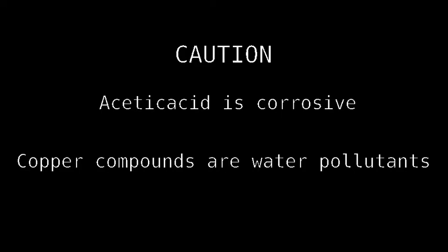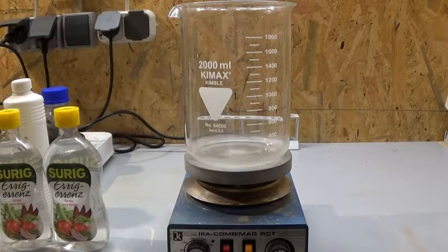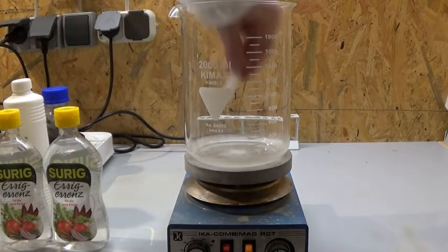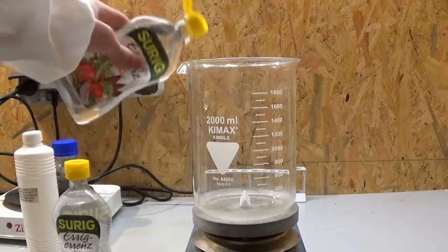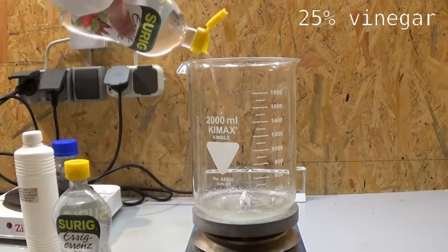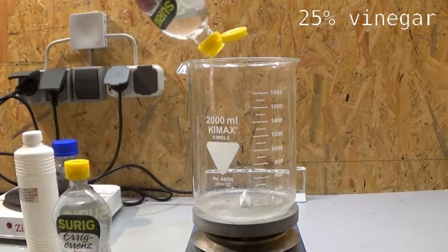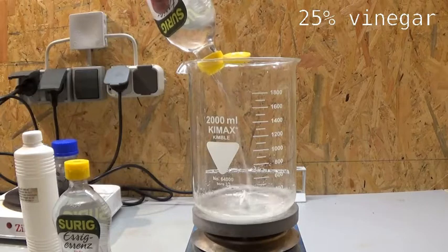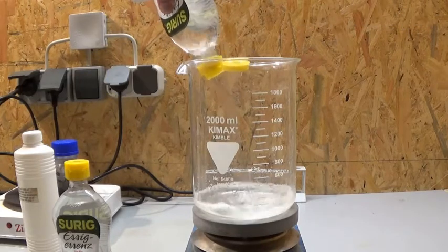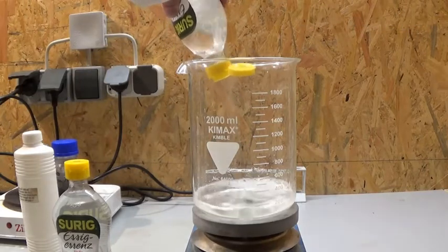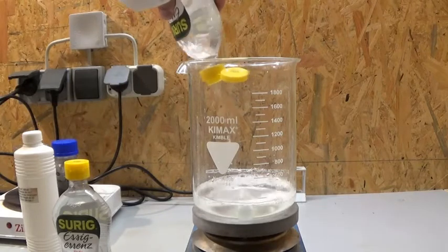Hello everybody. Today I will do the first step of my big scale lead 2 acetate synthesis, starting from calcium carbonate and acetic acid. Pay attention because acetic acid is corrosive. I am starting with 25% household vinegar as a cheap acetic acid source, then I add an arbitrary amount to my 2 liter beaker and put a magnetic stir bar in it.